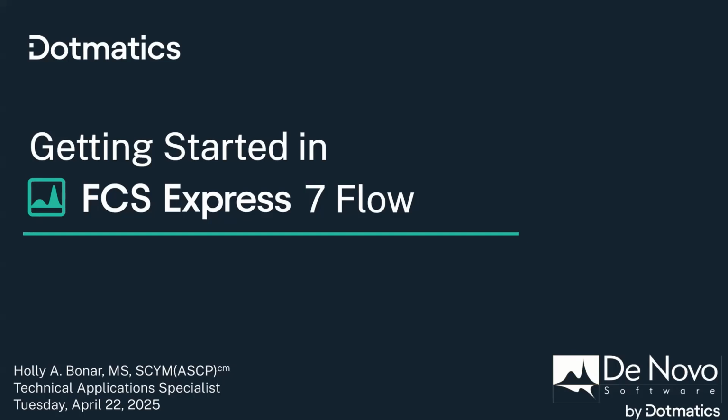For this webinar, we're going to start from scratch, take a look at the software, and see how to go from the very beginning of things all the way to having a saved layout that you can use to analyze your data over and over again going forward.